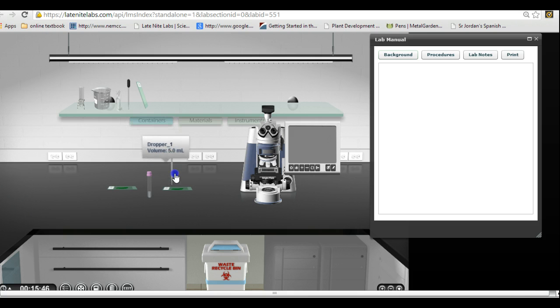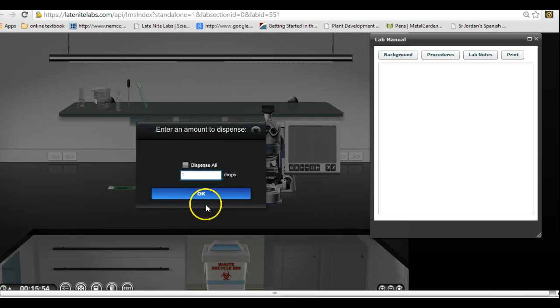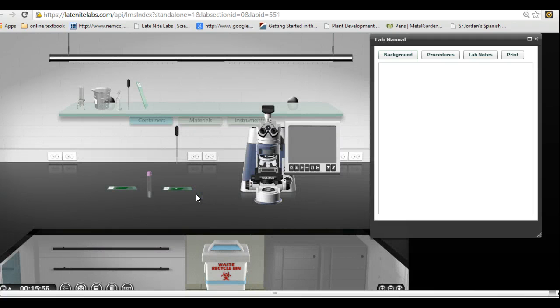Now we're going to go over here and we've got to get that in just the right spot. Notice the slide, when I brought it down there the slide's glowing. And it says how many drops. I want to put one drop on there. So I've got my one drop on there.